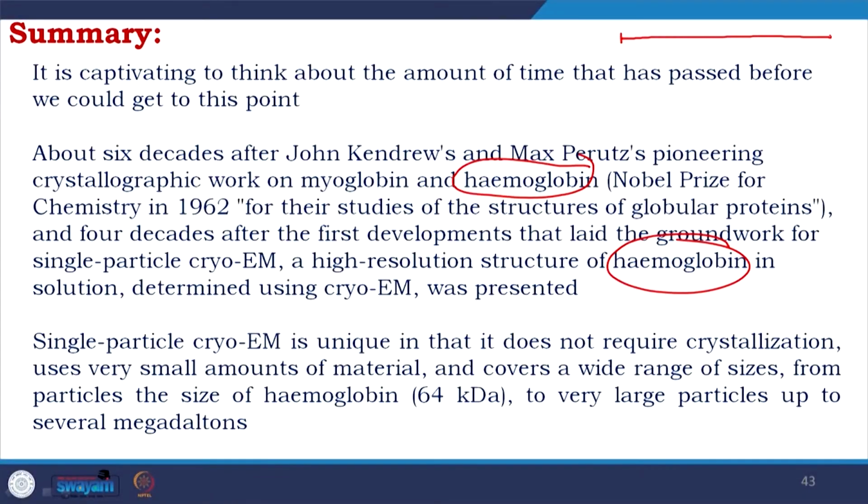So, at that point you could compare NMR, crystallography and cryo-EM. Cryo-EM goes from more than 50 kilodalton to several megadaltons. X-ray covers from low to this.